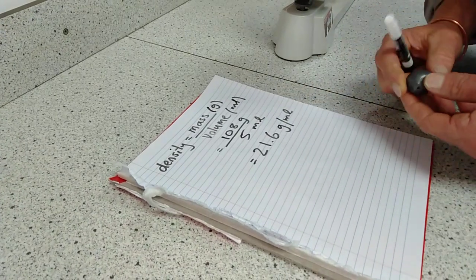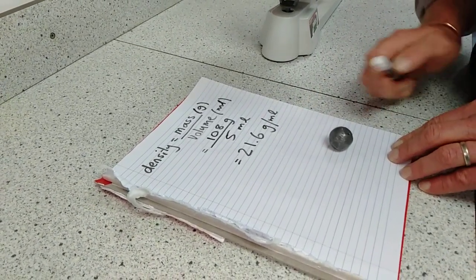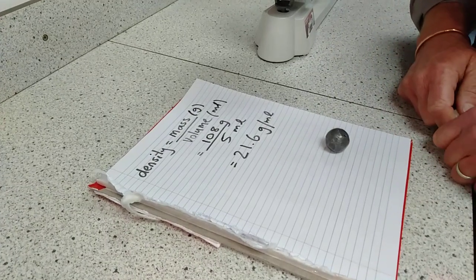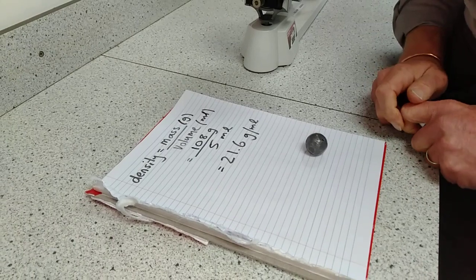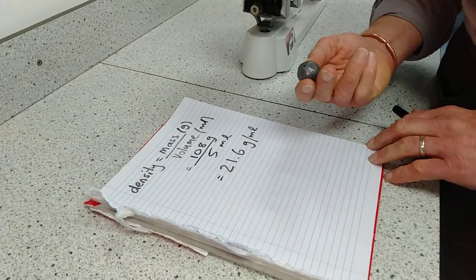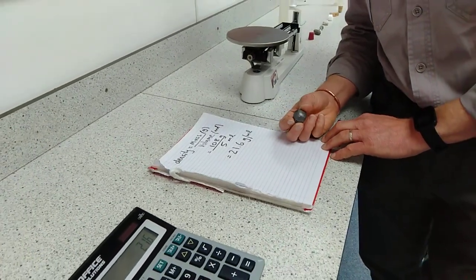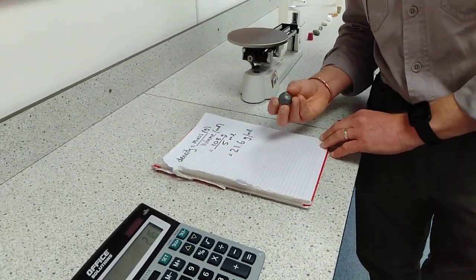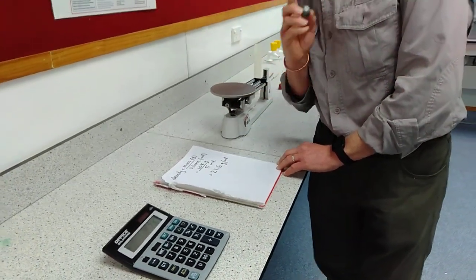So in this case, the lead sinker, which feels like lead and does look like lead, has a value of 21.6 grams per milliliter, a value you could go and check up on the internet and see how it compares to lead. If it's more, then it is something that is more dense than actual lead. If it is less, then it is probably something that is much less dense than lead. We'll leave that for you to check.